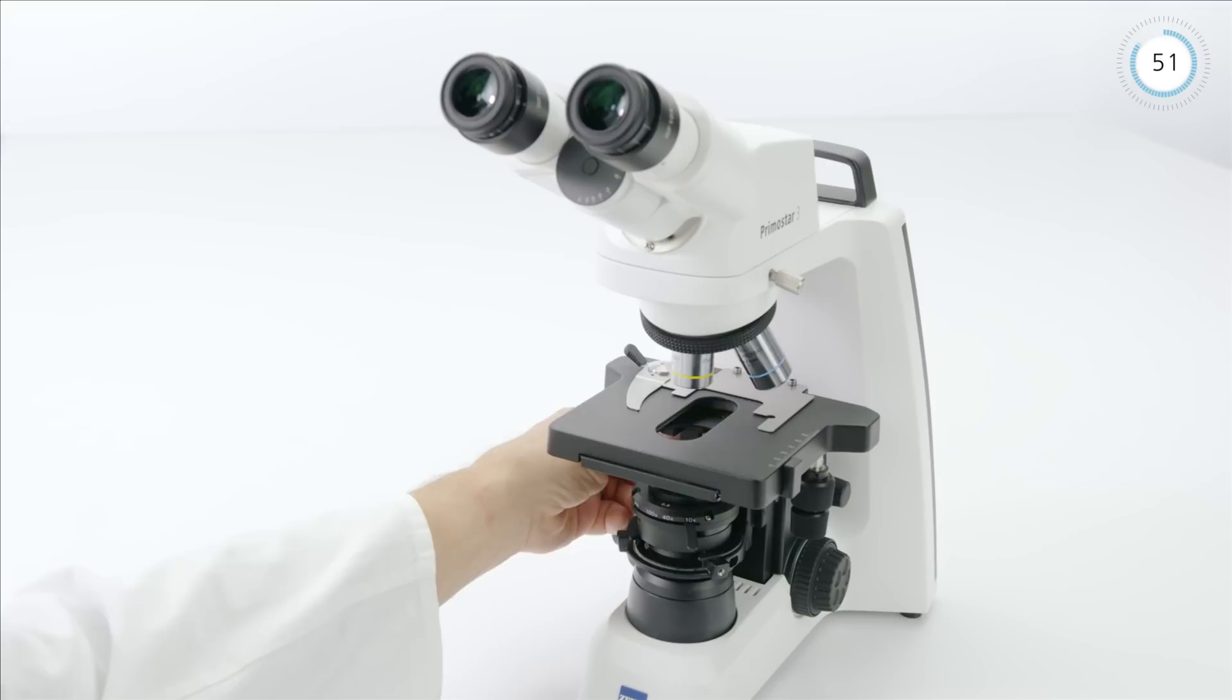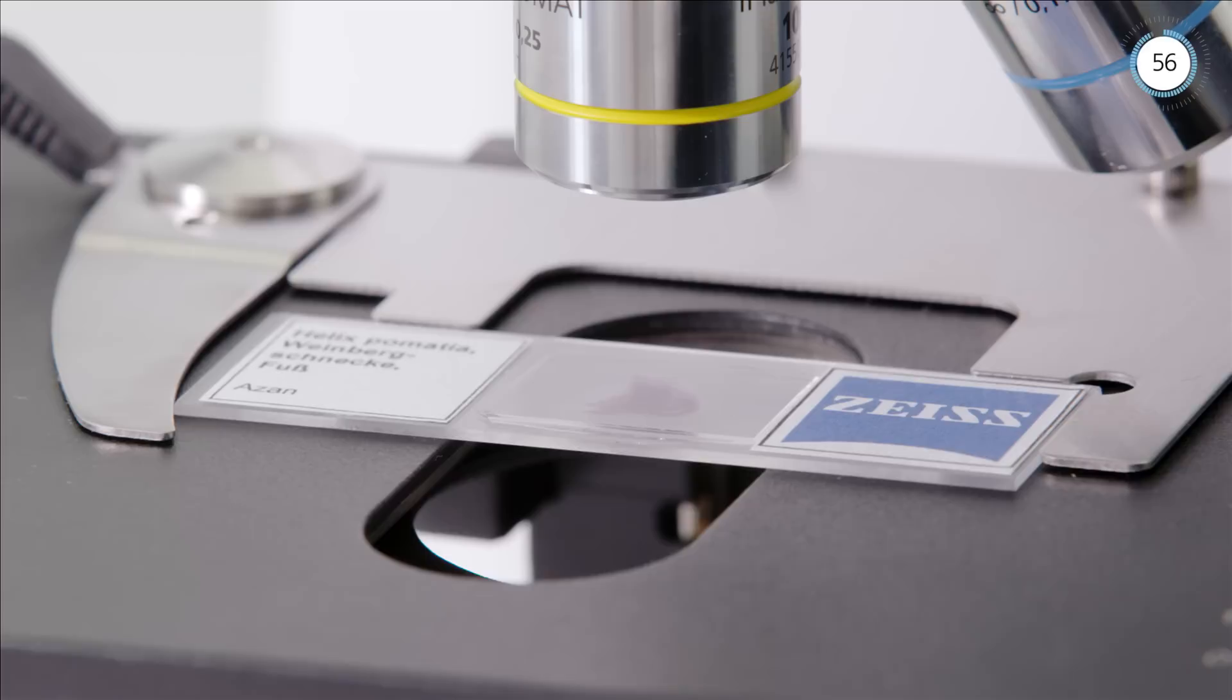Fixed Kohler versions of PrimoStar 3 come pre-adjusted with a field of view of 20mm and a 4x nosepiece.